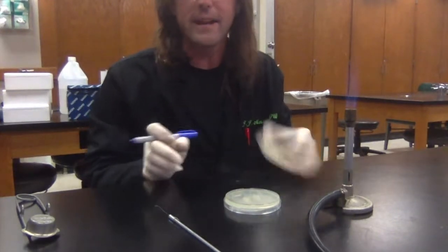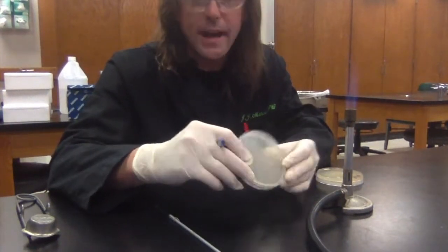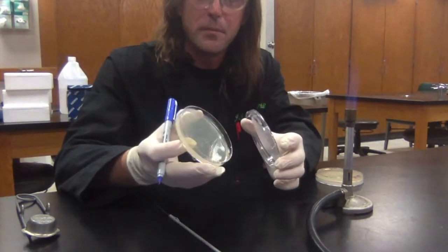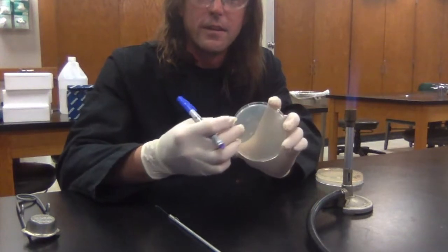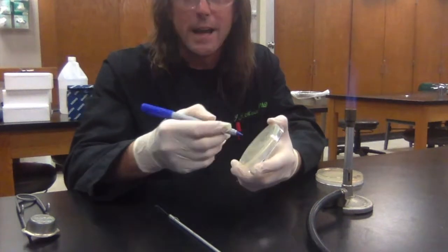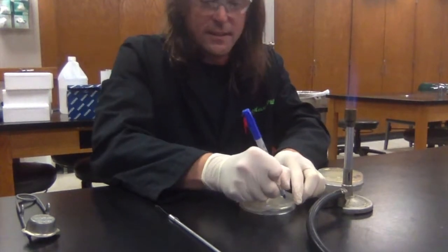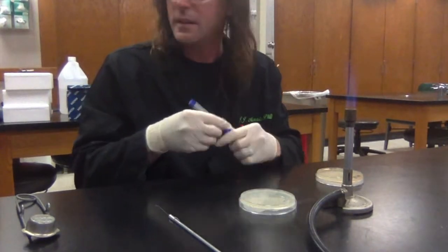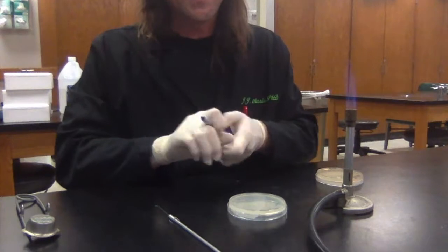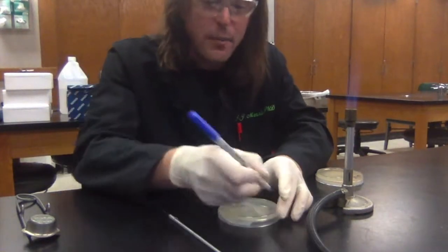Before I do anything, I'm going to go ahead and label my new plate. You always want to label it — we've got two parts: the lid of the petri dish and the bottom, which has the agar in it. You always want to label the bottom with the agar, so if you drop the plate and the lid rolls off, the label stays with your bacteria. I'm going to label this 'test.'